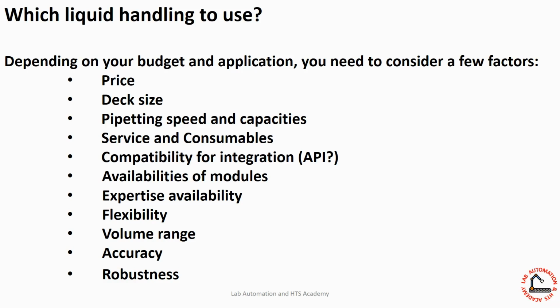And you would see differences between different liquid handling robots based on accuracy and robustness. The main reason is that they use different mechanisms, different modes to transfer liquid, to pipette the liquid. Not all of them use the same syringes and the same mechanism. Each of those companies has hundreds of patents on the mode of liquid transfer, the mechanism that they use.